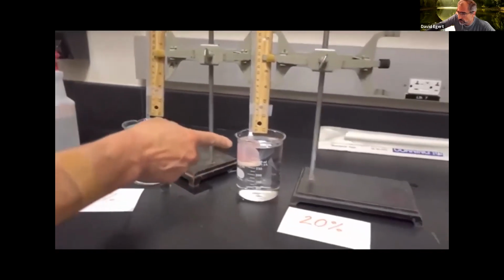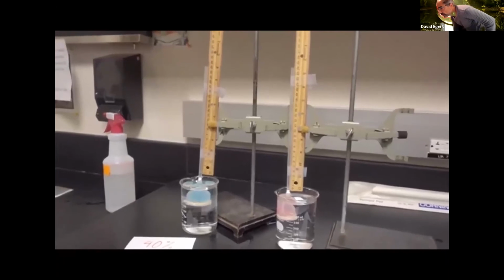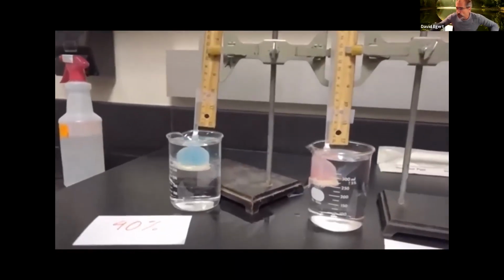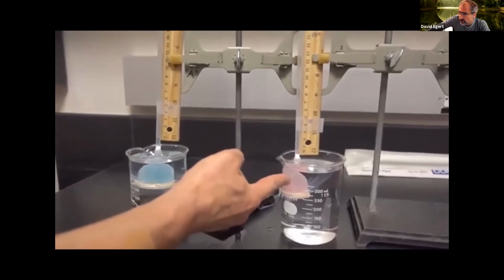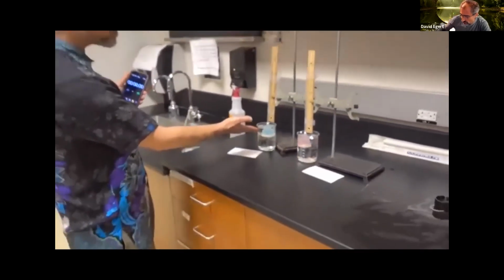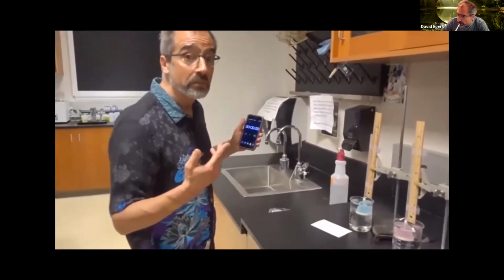This has the 20% sucrose. That sets up two different concentration gradients across the dialysis membrane: 40% on the inside and 0 on the outside in this case, 20% on the inside and 0 on the outside in this case. So we have twice as strong a gradient, and we're going to see how that affects osmotic rate.